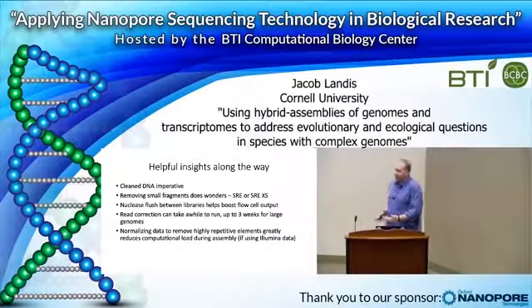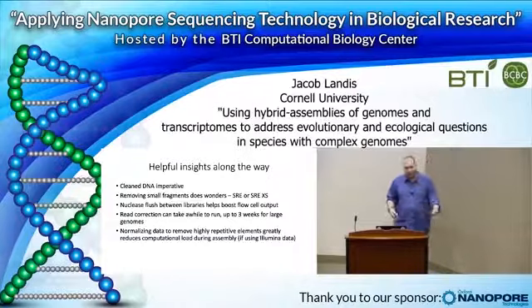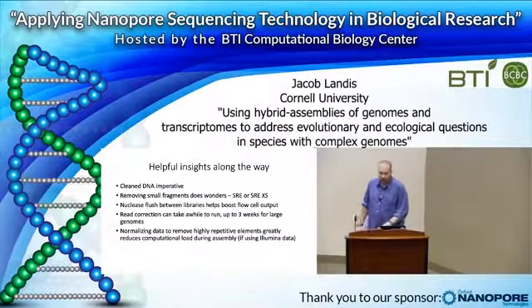The read correction can take a long time, especially with larger genomes. You can do that before or after assembly, depending on which way you want to go, but it does help. And then again, for the really large assemblies or large genome things, normalizing the data has helped a lot with computational parts of it.